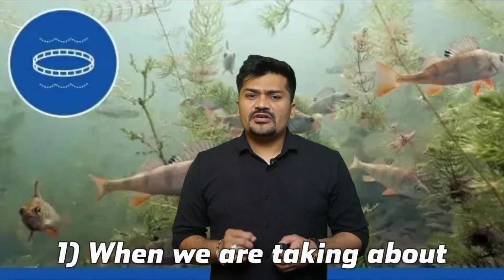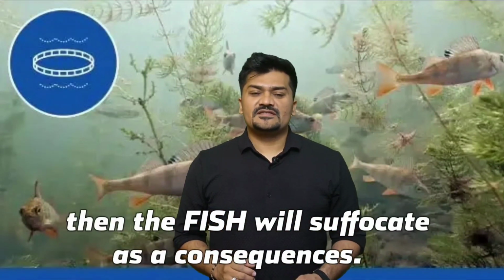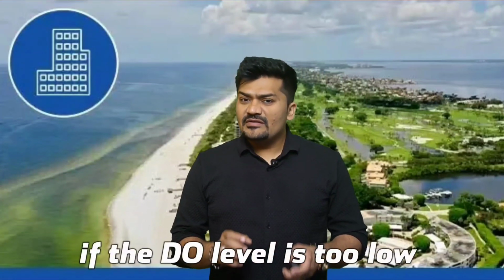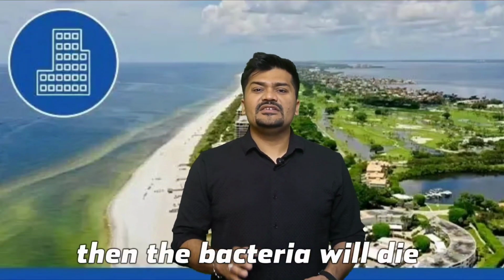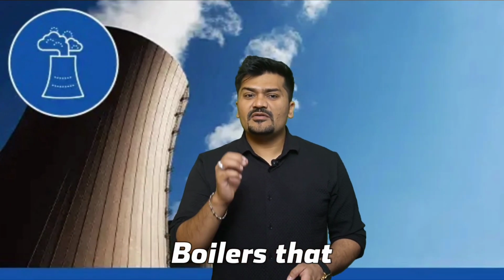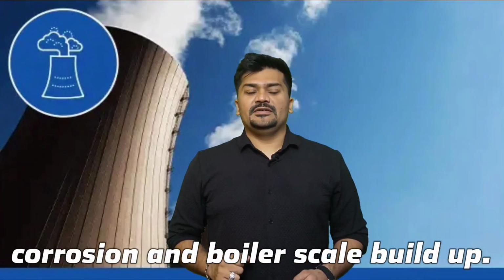Now let's understand why dissolved oxygen measurement is necessary. First, when we are talking about aquaculture, if the DO level falls too low, then the fish will suffocate as a consequence. Second reason is in sewage treatment plants, bacteria will decompose the solids. If the DO level is too low, then the bacteria will die and the decomposition will be very slow or will not happen. Third reason is in boilers, the makeup water must have low DO levels in order to avoid corrosion and boiler scale buildup.